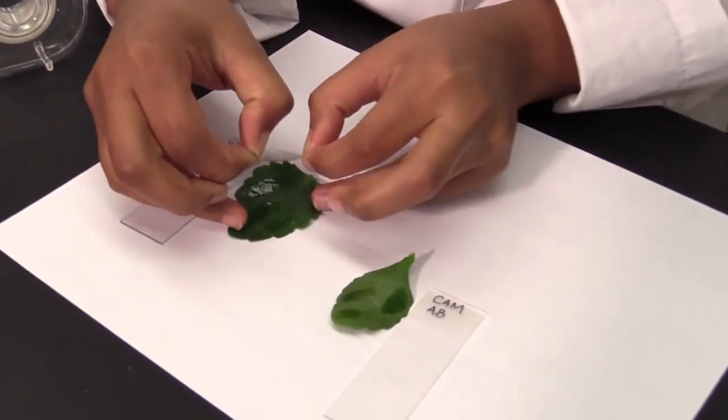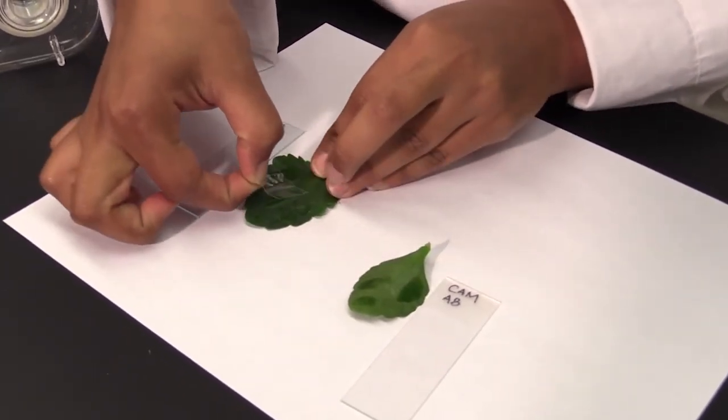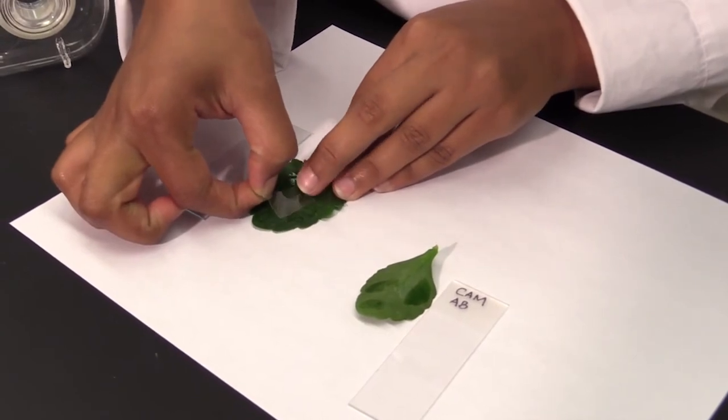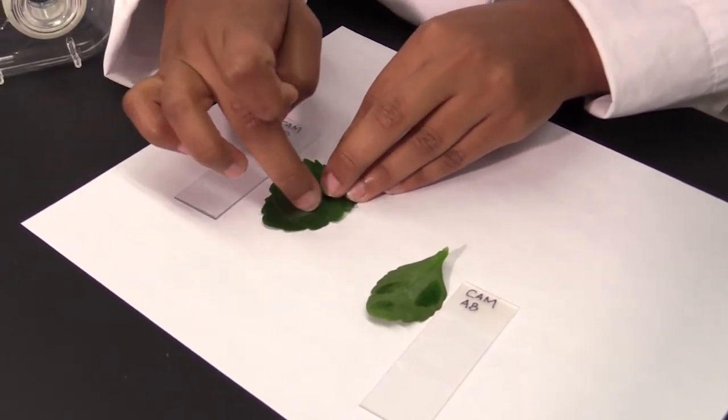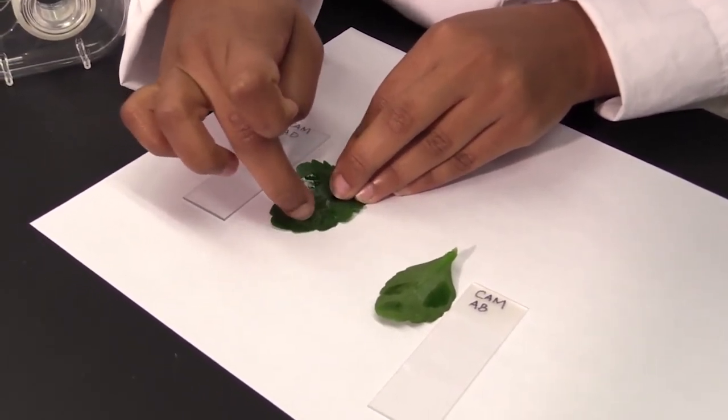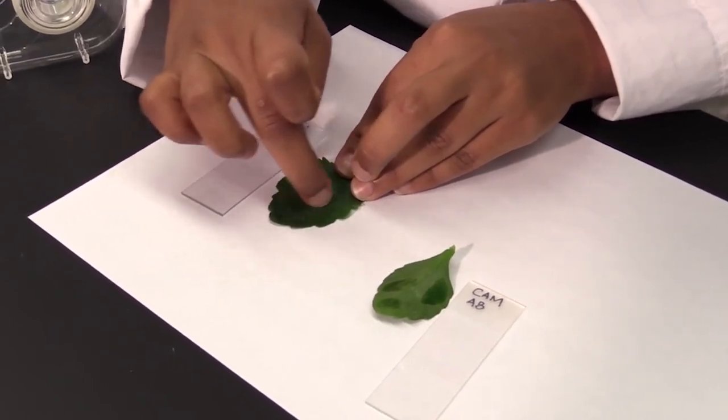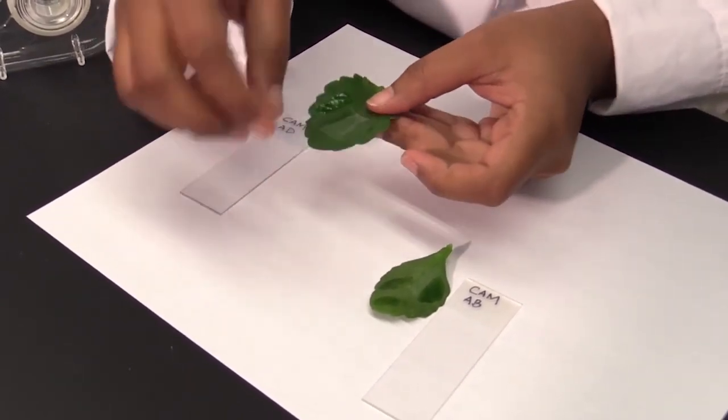Once you've cut the tape, place it on the dried nail polish patch. Press down on the tape to ensure good contact with the nail polish, and then pull on the corner of the tape to remove the nail polish impression.